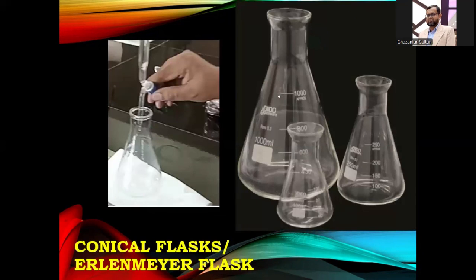These are the conical flasks. These are also called Erlenmeyer flasks. And these are specialized for titration, but they also have some other uses in biological laboratories or in laboratories for other functions.